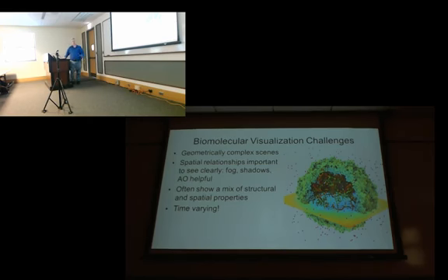So just to give you an introduction, if you think of molecular visualization relative to other scientific visualization pursuits, some of the things that make molecular visualization challenging are the fact that we have very large, geometrically complex scenes. Today, this would be considered a relatively small structure. This is a million-atom satellite tobacco mosaic virus, and it's drawn showing the capsid and the ions and the RNA in the interior, and a little slicing plane that's colored by electrostatic potential. And in an image like this, there are lots and lots of things to see, and making a clear image out of a structure like this is quite a challenge.